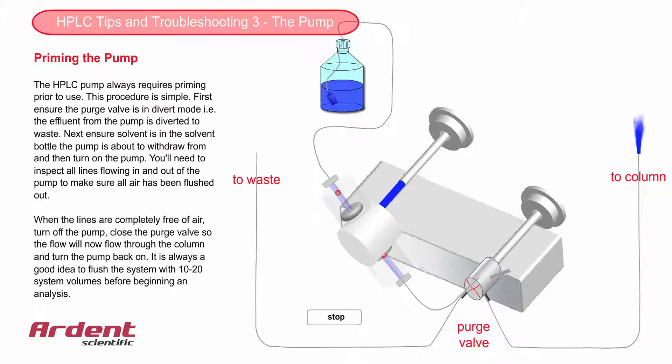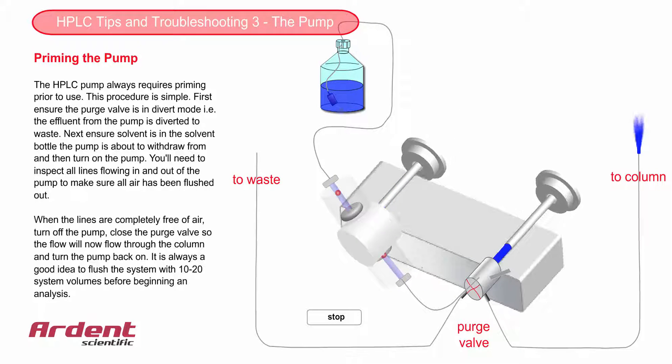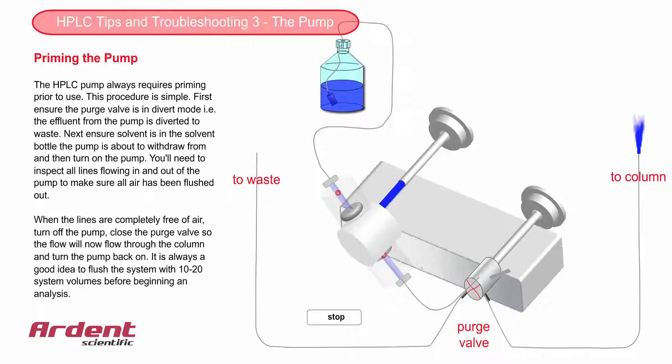Now let the pump run to completely flush out the system before beginning your first run. A rule of thumb is 10 to 20 system volumes worth of solvent. In a conventional HPLC system, the system volume will be of the order of 1 to 2 mils, so leave the pump running for, say, 10 to 20 minutes before you start your first analysis.